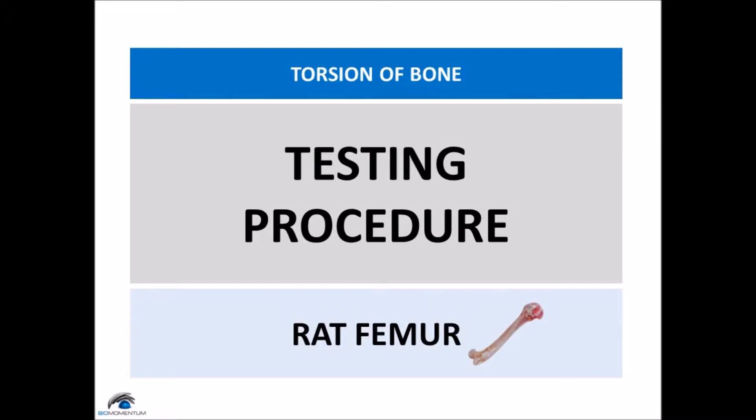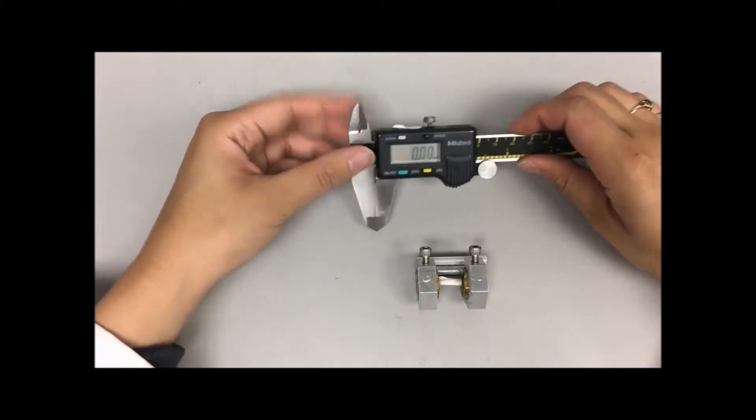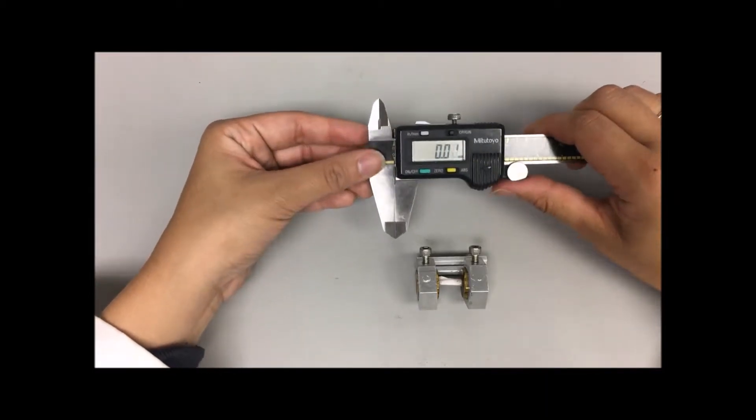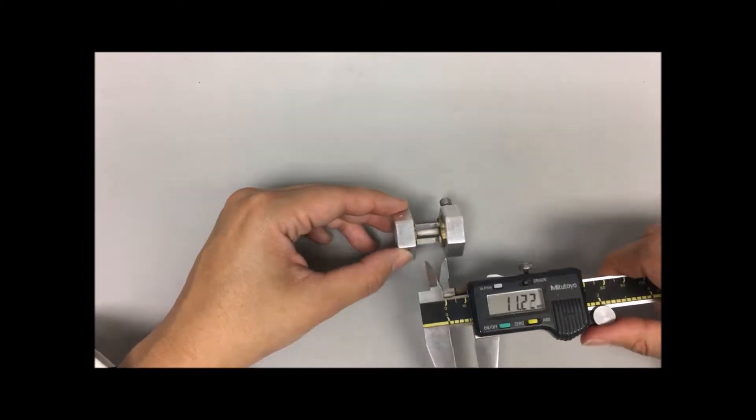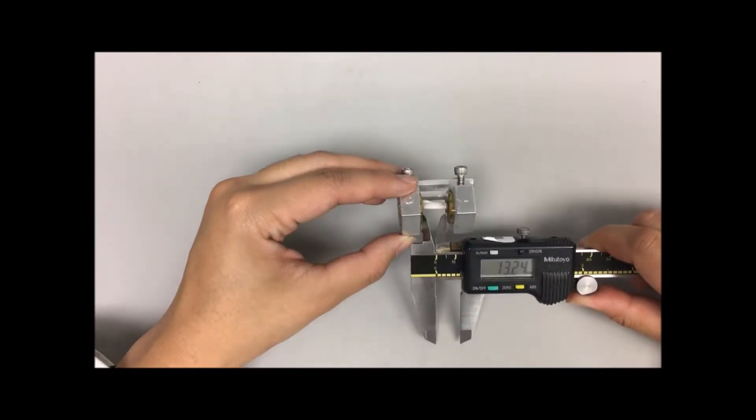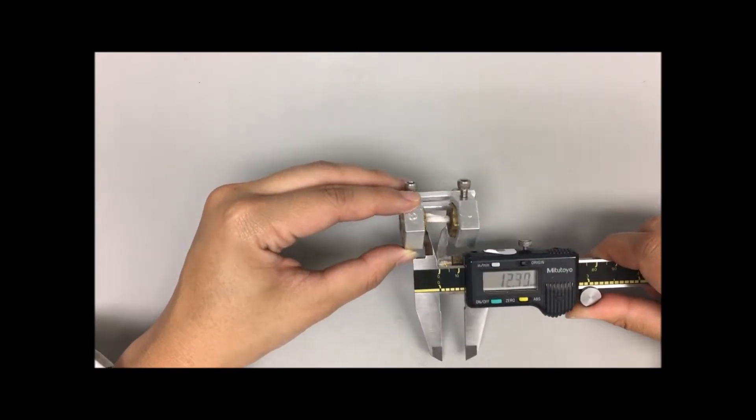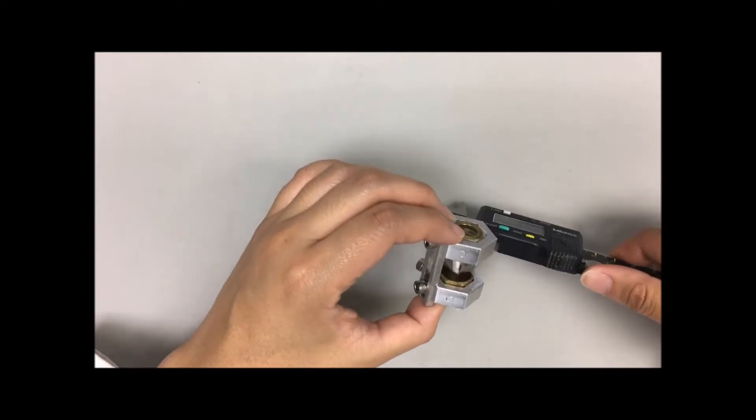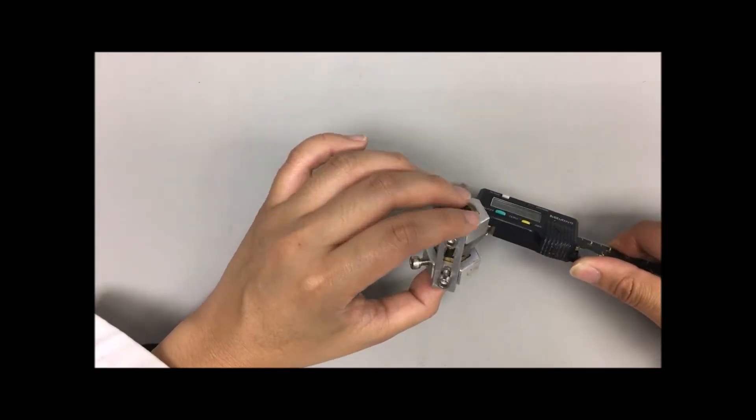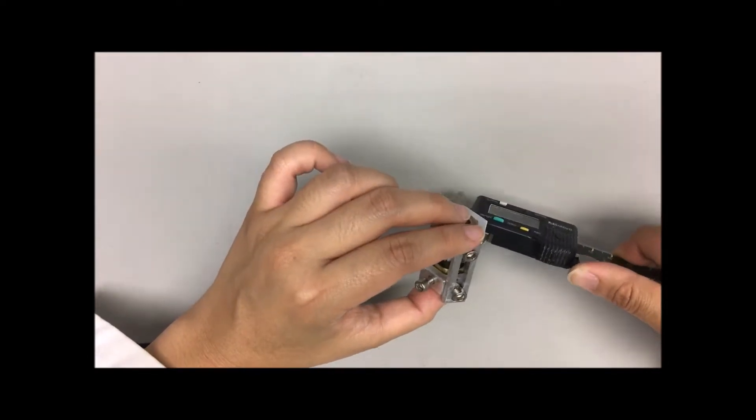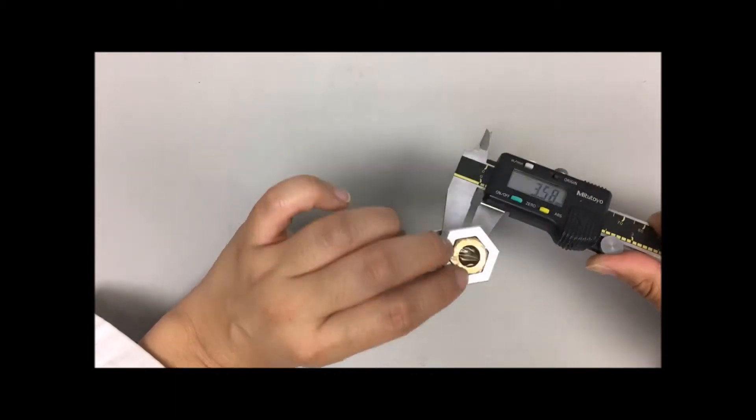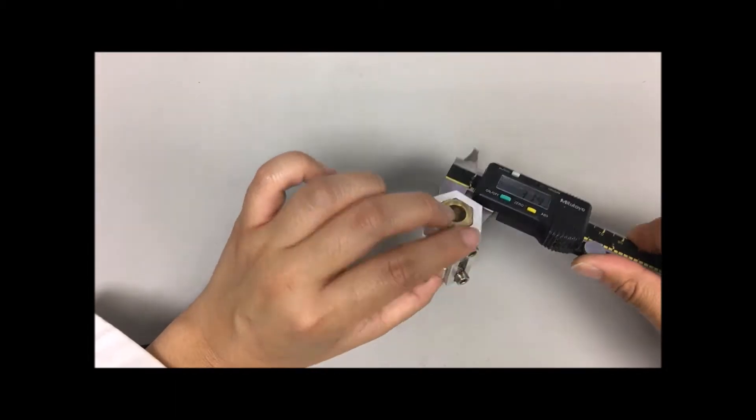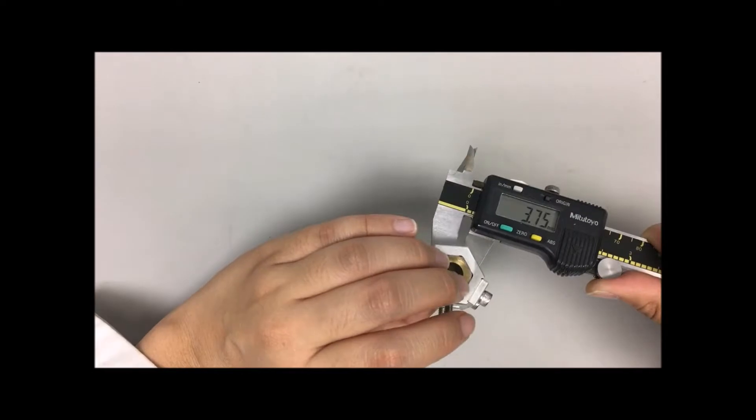Now the testing procedure for the bone sample. Measure the sample gauge length, which is the section that is not set in the resin, using a caliper and report the value. Then measure the sample diameter at three different positions twice by measuring the diameter of the narrowest part of the bone and the thickest part of the bone, and report the values.